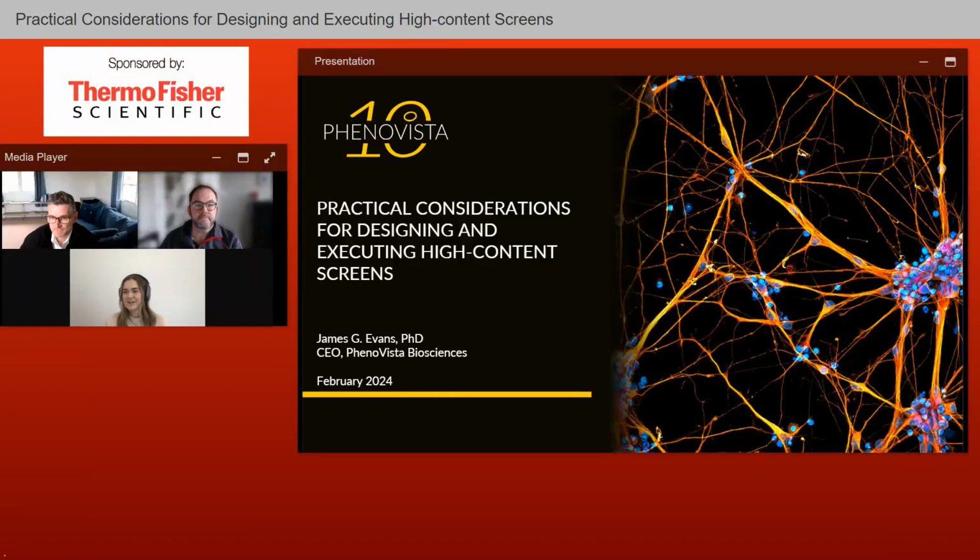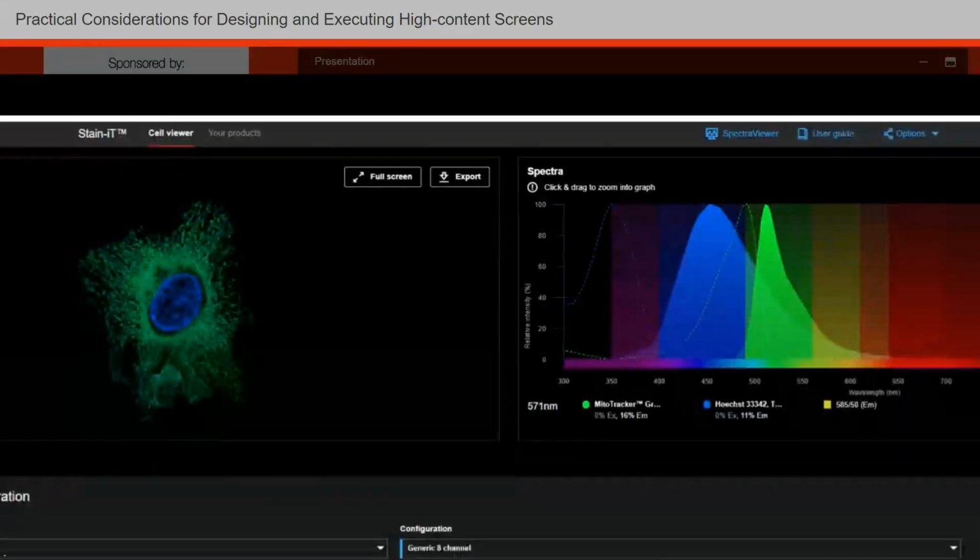Great, thank you. Steve, I've got a question for you. Is there a way I can enter a custom configuration for my microscope? And how would I know what configuration is for my microscope? A great question. Let me see if I can share my screen and show you. Can you see my screen okay? Yes, we can. Okay, perfect.